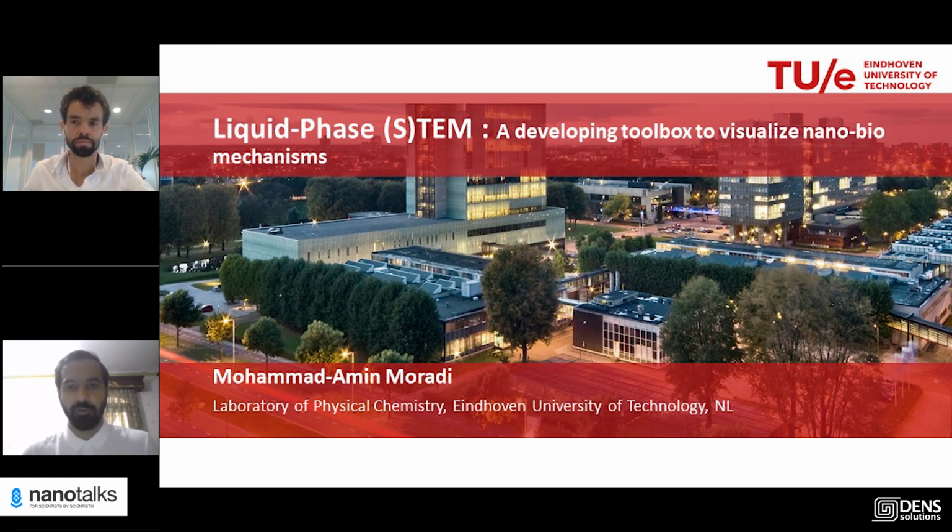As soon as you go for carbon films underneath or multi-layers of graphene to make more mechanical stability of the cell and package more water in your graphene cell, you get a higher risk of bubbling inside your sample quicker than before. So this is all the optimization of your beaming system. As I showed in the stream holder, you have to play with your beaming schedule.